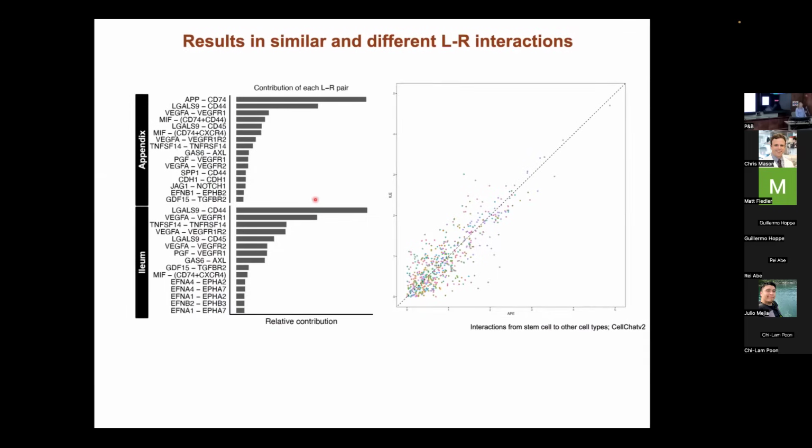I'm going to skip over this part. And just to ask, that interaction is based on like closest cell type to like. So some of the analyses can be run that way. Some of them can be based on different ligand-receptor interactions, but based on the spatial organization within that. It depends which algorithmic approach you try to take. Okay. And obviously, the more you get into the weeds, the more speculative those are, that one would probably want to test those. Well, you're going to want to test these all anyway, but absolutely.